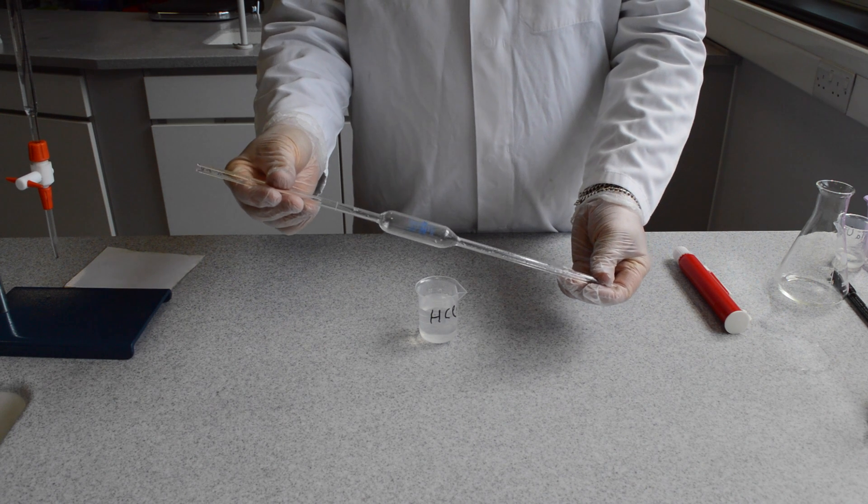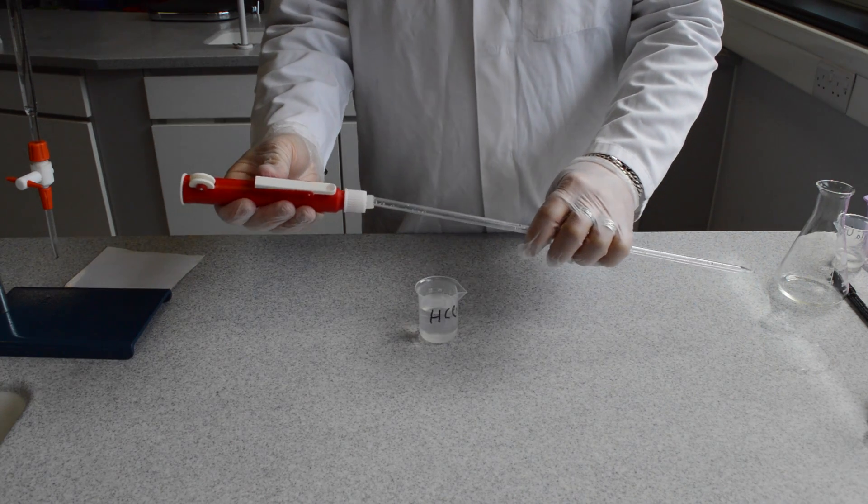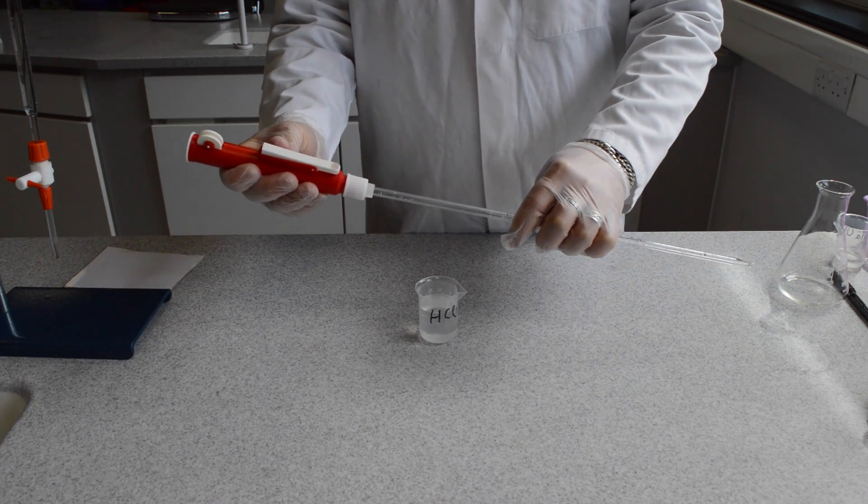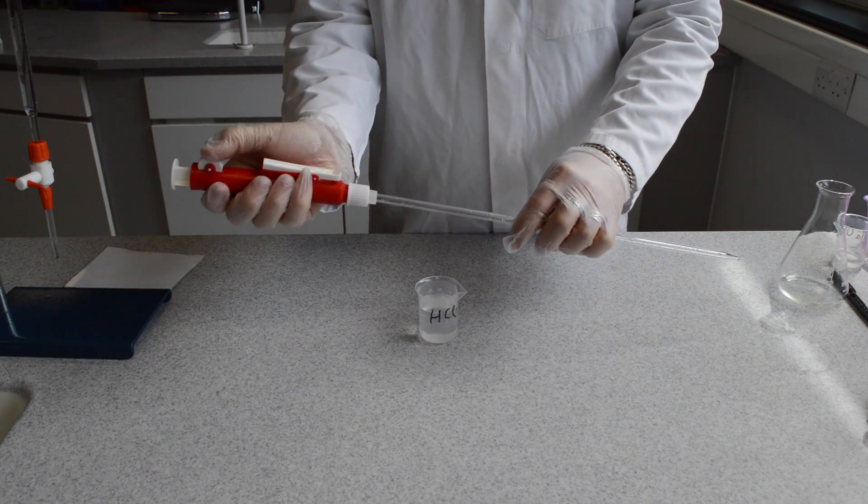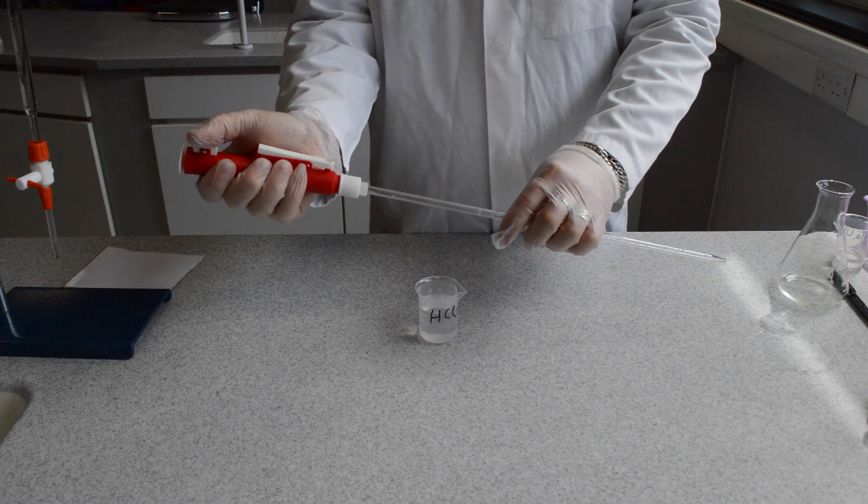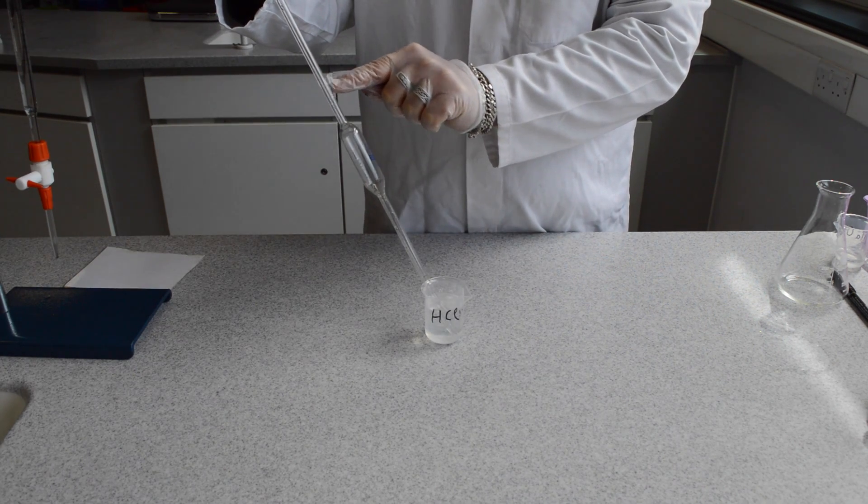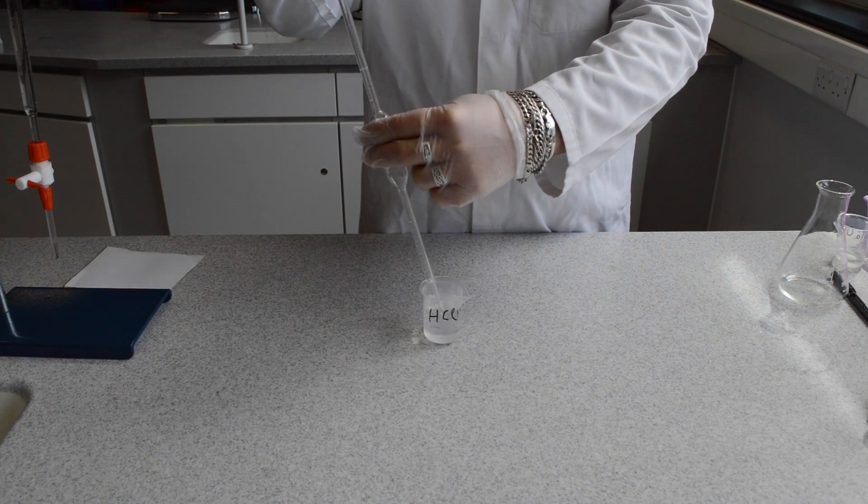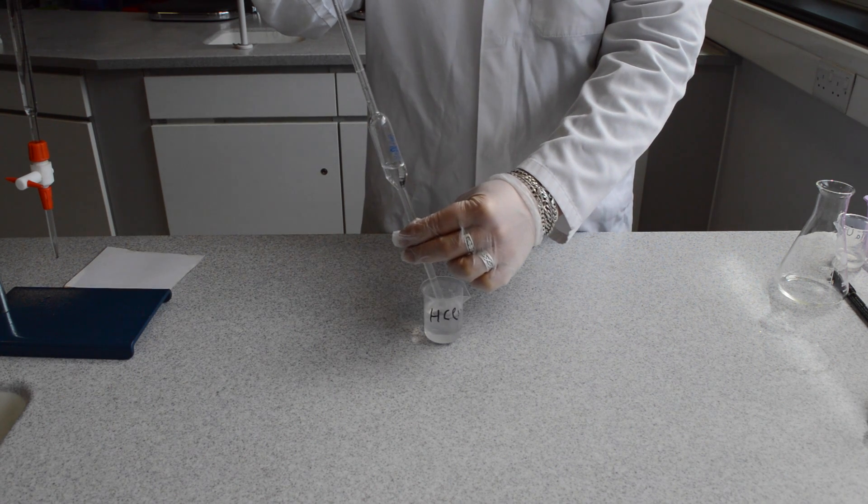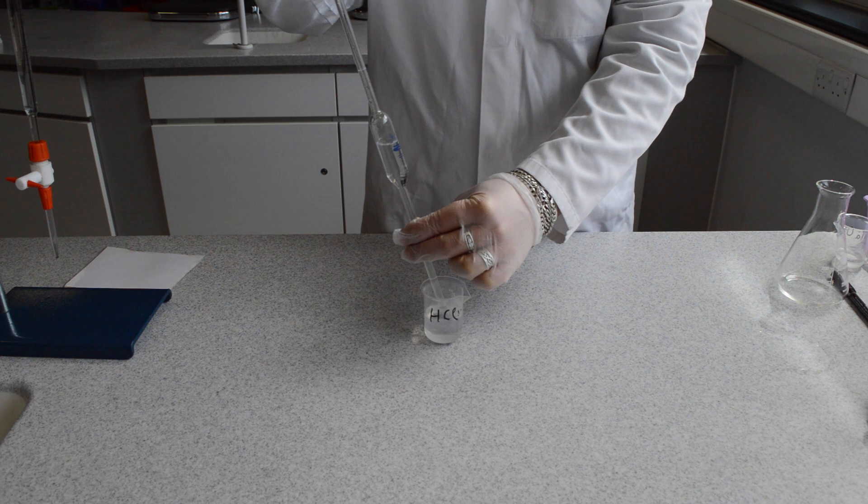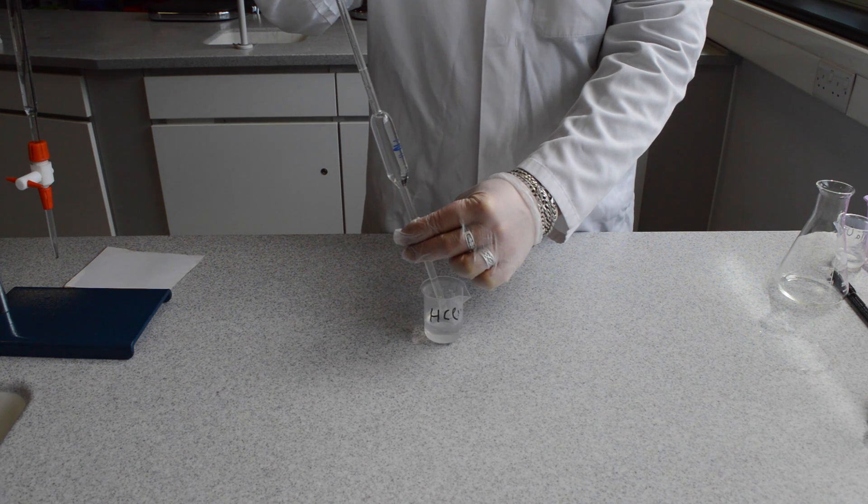The initial stage of performing the titration is to draw up an accurate quantity of hydrochloric acid using the pipette filler and the pipette. There is a mark on the pipette that accurately indicates 25ml. Fill up your bulb pipette slowly and carefully using the pipette filler to this mark.